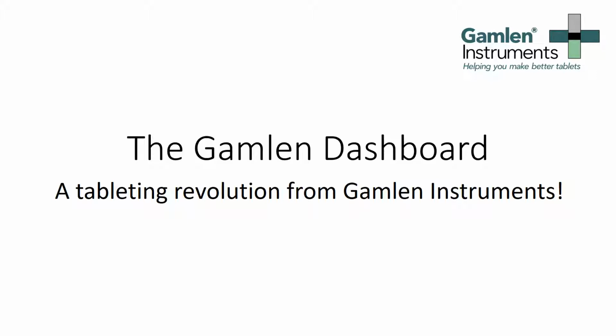Making just one tablet can tell you all you need to know about manufacturability for both new and existing tablet products. In many cases, one tablet can tell you whether your new product is good enough or whether your existing product is the same quality as a previous batch.